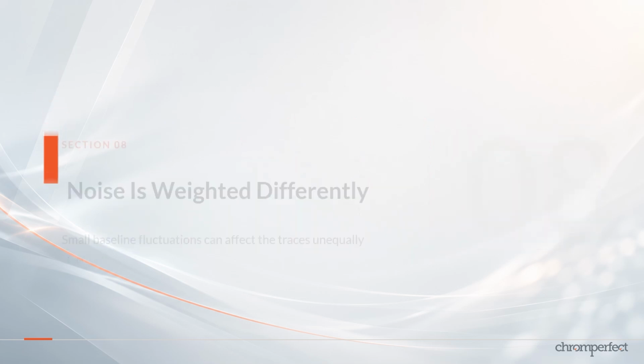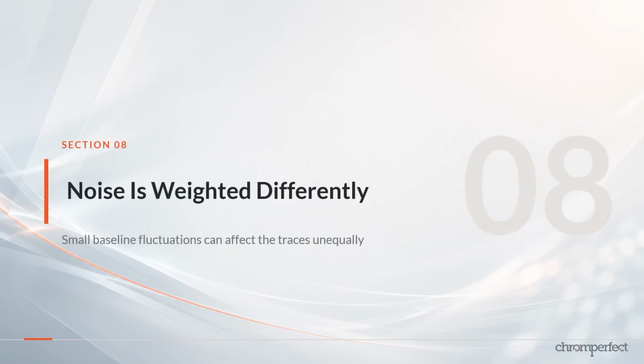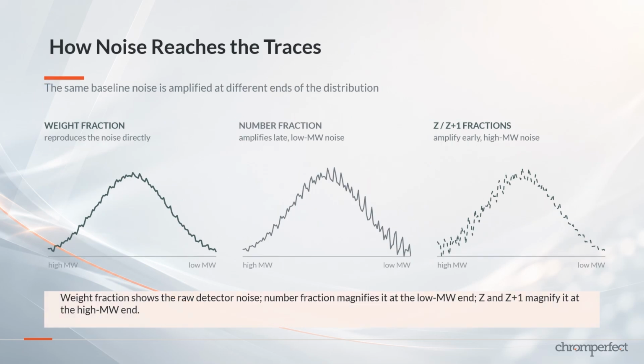The effect of noise on the different traces. Detector noise appears in the molecular weight distribution plot, but it does not affect every trace in the same way.